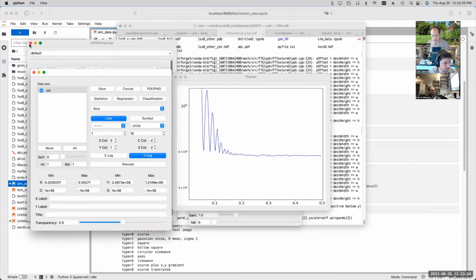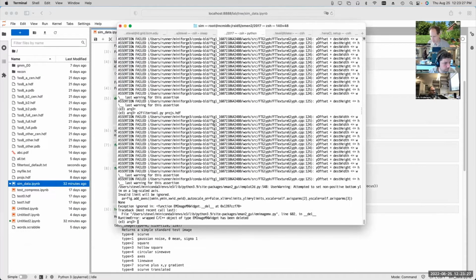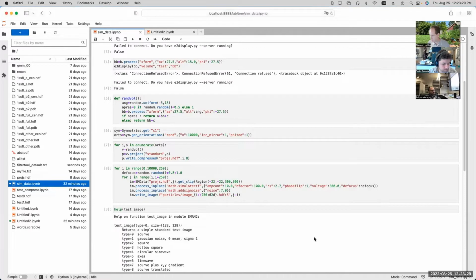Maybe just to think about Land's problem, Land was trying to simulate just a sphere, a circle, or an ellipsoid or something like that, pretending that it was some sort of a vesicle, and do that in a way that was a good simulation. But again, what she did was she just took basically black, 0 everywhere, and then she put an ellipse, which was 1 inside the ellipse, and put that down in space.